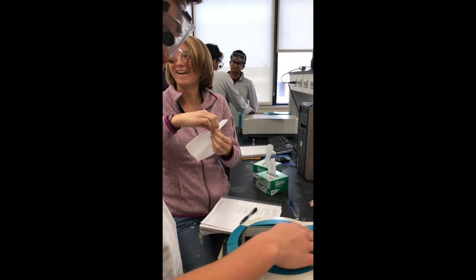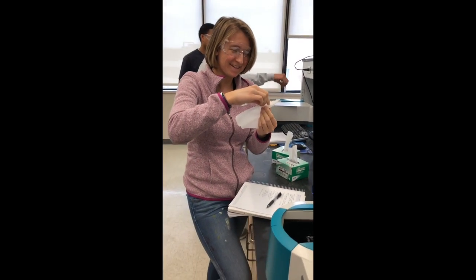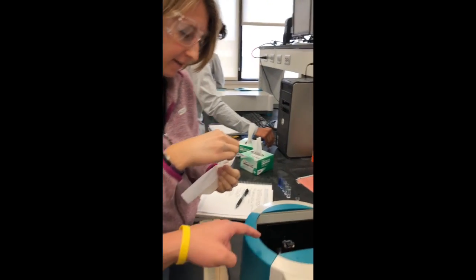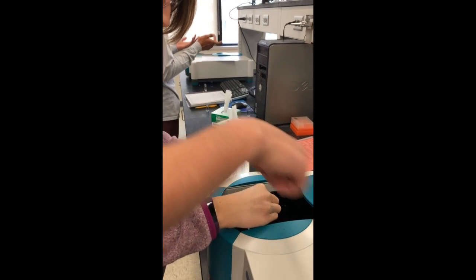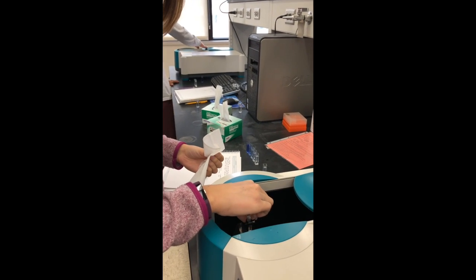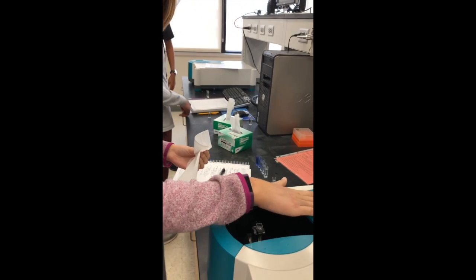After preparing the cuvettes, students must wipe two sides of each cuvette before putting it into the spectrophotometer. Here, students are wiping the blank so that they can zero the spectrophotometer before scanning all wavelengths in order to find the lambda max.